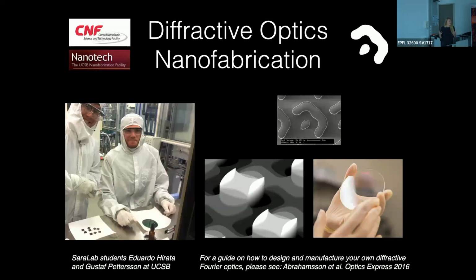So in the US, we have these open nanofabrication facilities that are really for semiconductor physics, where you can also go and process glass. And in France, you have a bunch of these too. I haven't visited one of them yet. There is something on campus that I don't even know what they have, but I know that the Planète in Marseille, you can access and do these things. So diffractive optics are really beautiful things. I brought some diffractive optics here. We're going to talk about what you can do with them in a little bit, but just so you see what we're talking about, it's pieces of glass. So when you do diffractive optics, you can do amplitude gratings.